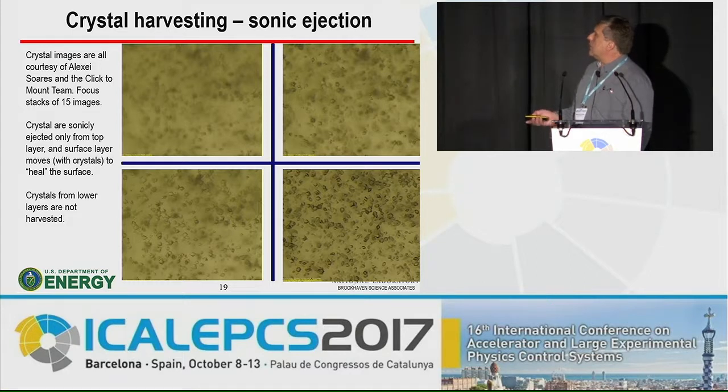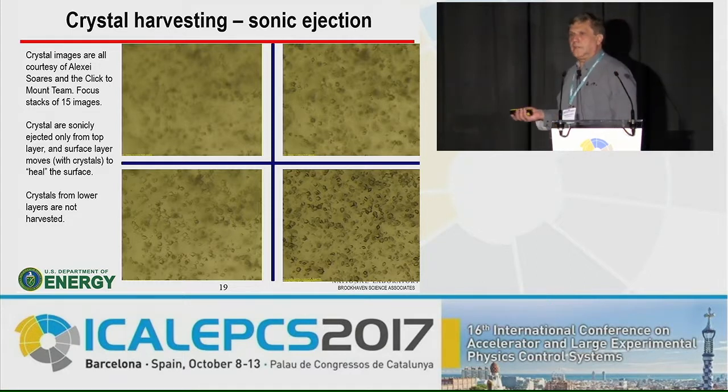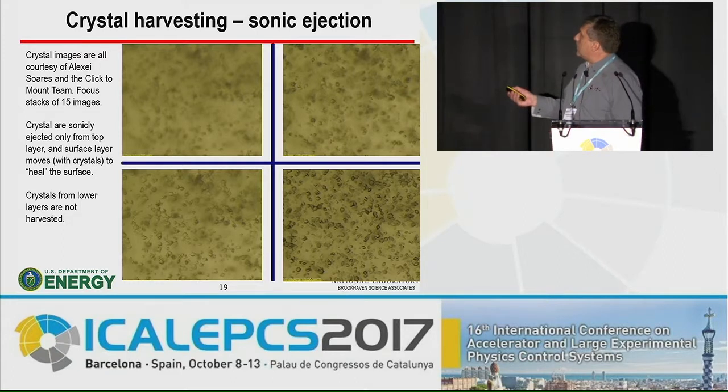The challenge there was that the technique works only for a while. The technique itself is that an acoustic wave ejects an individual crystal or a group of crystals from small regions here. Crystals are harvested. It's very difficult to do it manually. It's a lot of work. But they did notice that initially it works, a couple of crystals are collected, and then the process stops.